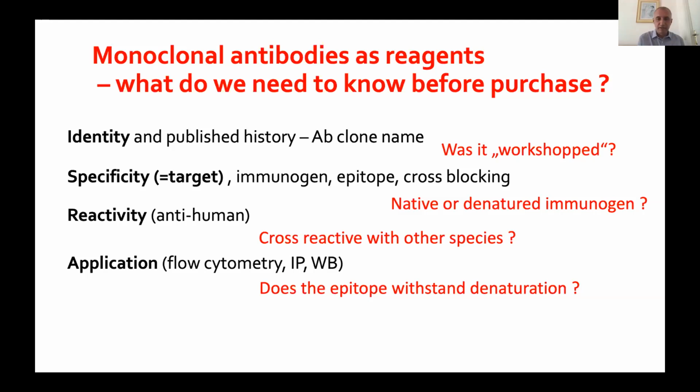However, Western blot tested antibodies that were used under denatured conditions are typically not good for flow cytometry under native conditions. Again, the difference is when you try to do a nuclear staining where you do fixation as one of the initial steps of sample prep. So then these epitopes are also fixed, so you will get antibodies that perform well for Western blot and also for flow cytometry.